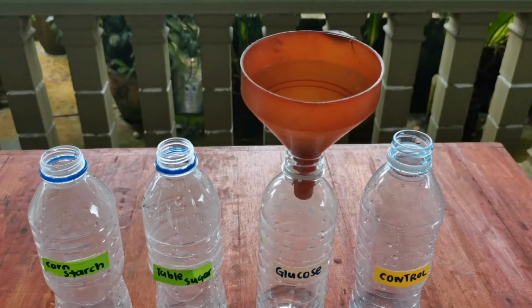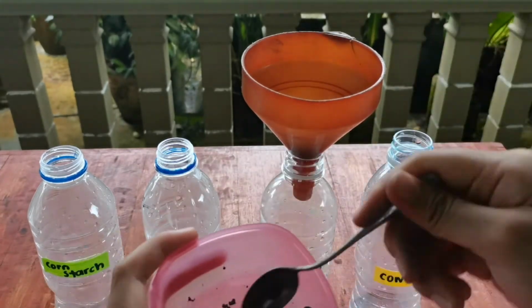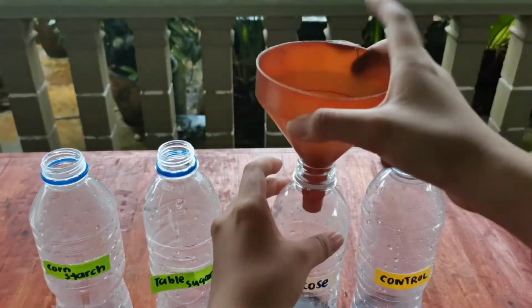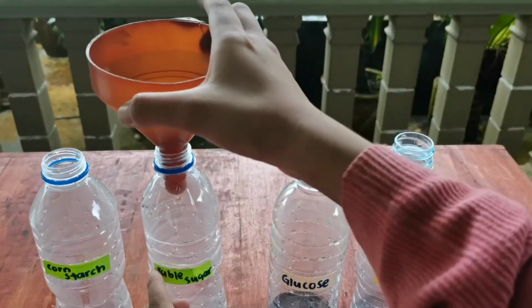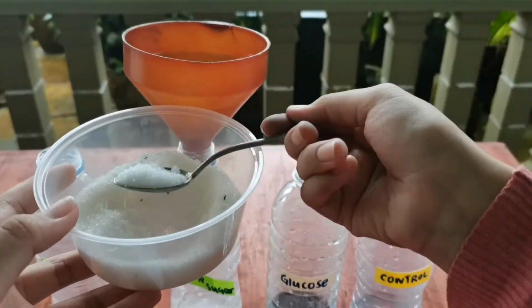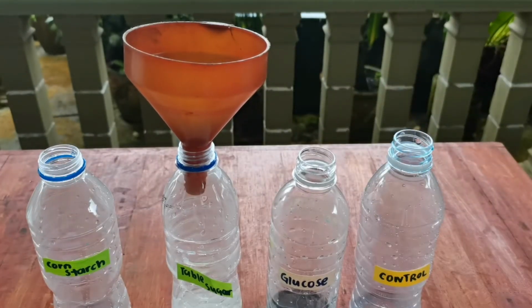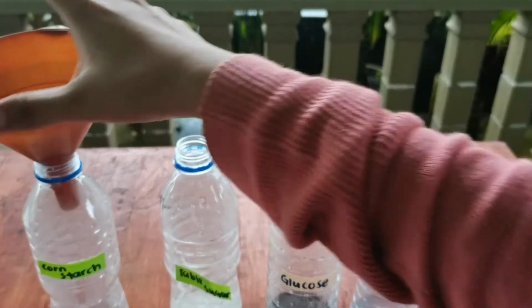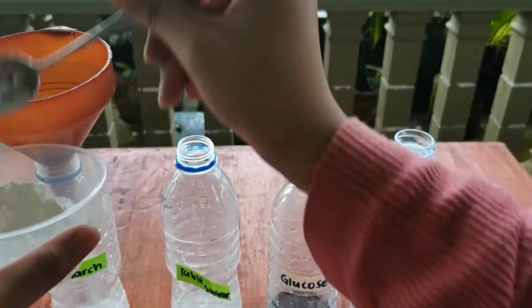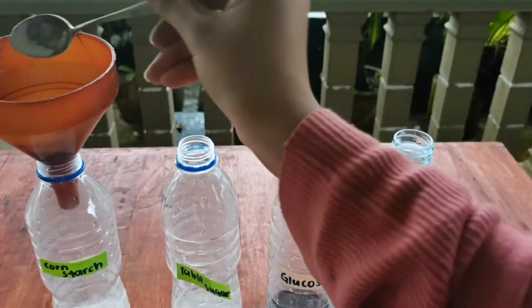By using the filter funnel, add 1 teaspoon of carbohydrate samples, which are table sugar, glucose, and cornstarch, into the labeled water-containing bottles respectively. For the control sample, no carbohydrate is added into this bottle. There will be the mixture of only water and yeast, and it acts as a control for this experiment.